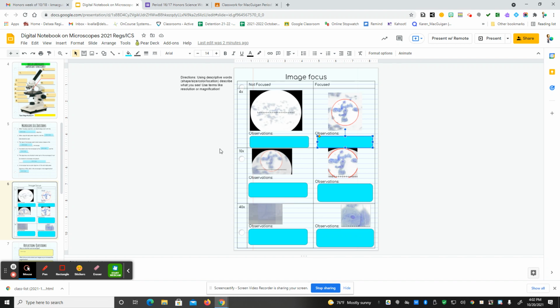These are actually cheek cells. So that's what you're going to do in comparison. You're writing down a couple pieces of evidence or pieces of data that you can see through those microscopes. Okay.